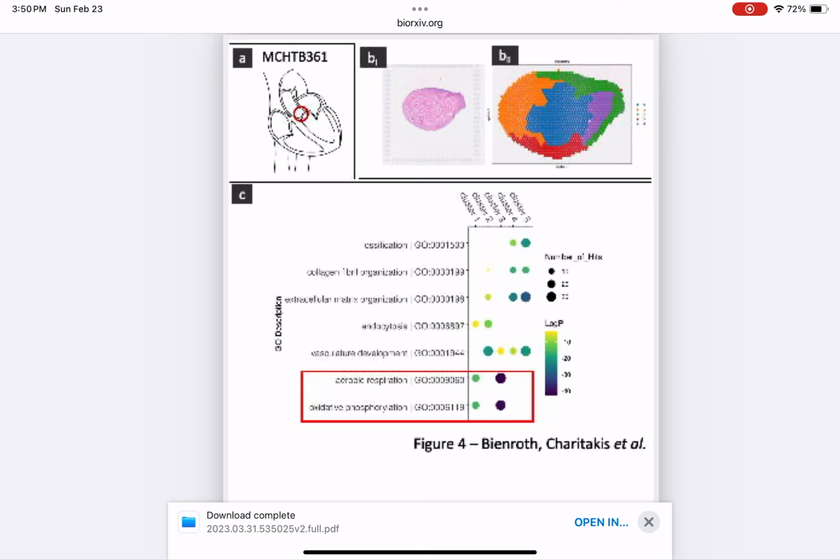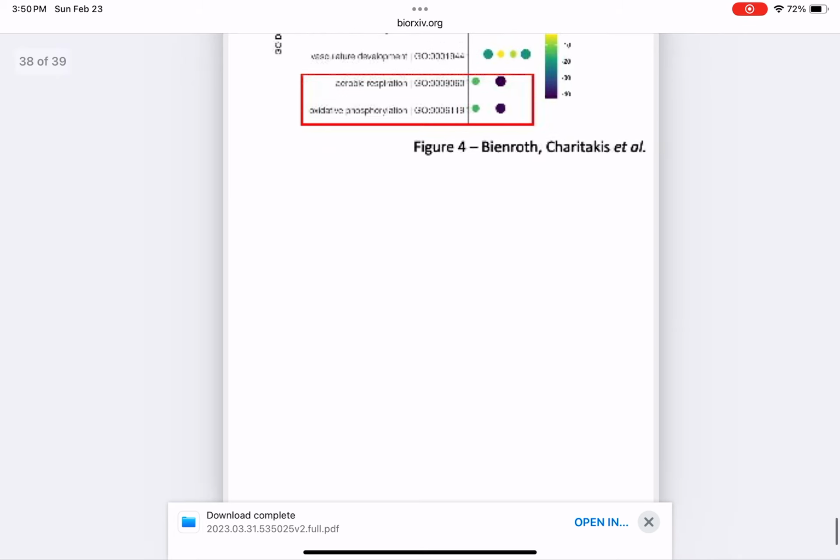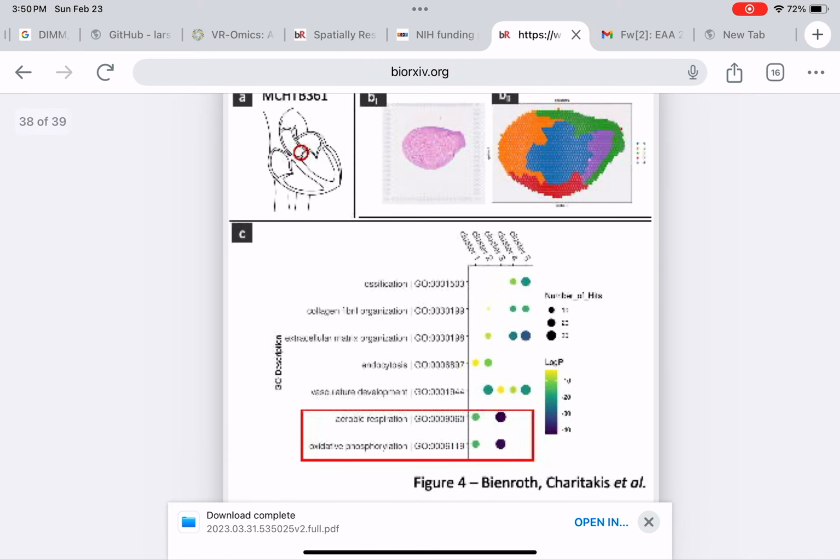Within these predominantly abnormal cardiomyocyte clusters, Figure 3 and Figure 4, there was evidence for altered transcriptional signatures through increased expression of genes such as SLC25A4, which is consistent with increased metabolic activity. Certain cell clusters also displayed upregulation of genes involved in the increase of glycolysis, potentially indicating the presence of the Warburg effect, which may contribute to the growth of these benign tumors. Moreover, the clustering performed across samples reveals additional transcriptional heterogeneity that cannot be identified using histological analysis of single-slice datasets, Figure 2 and Figure 3.